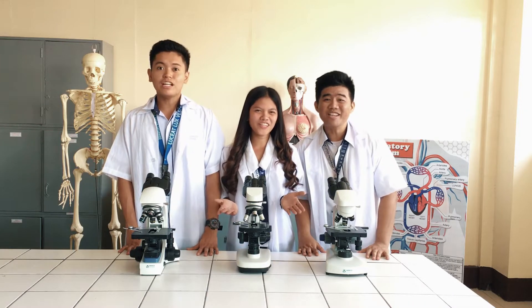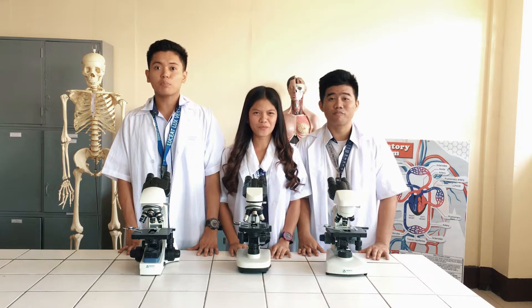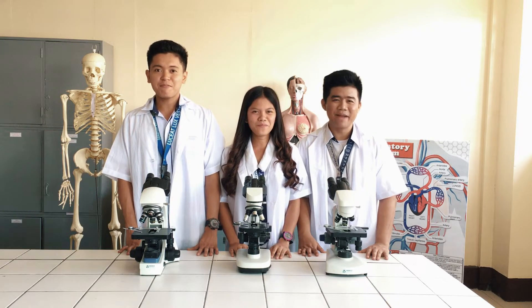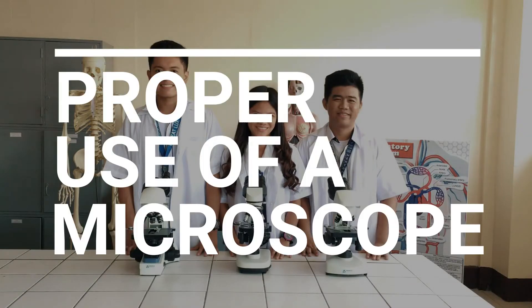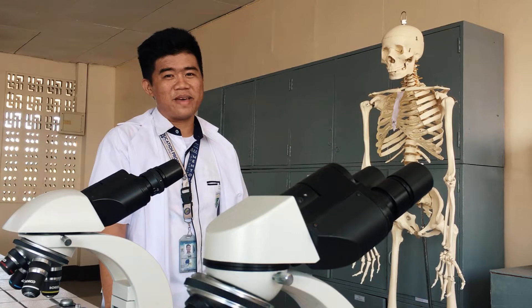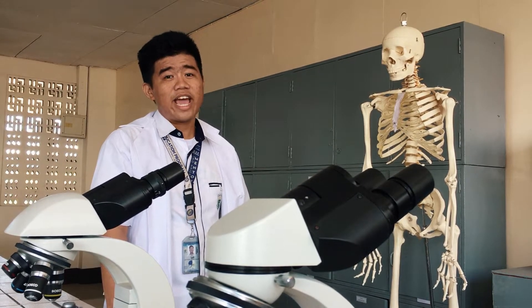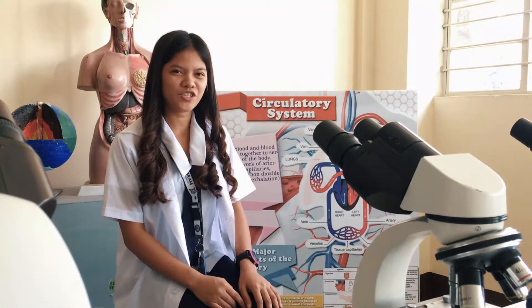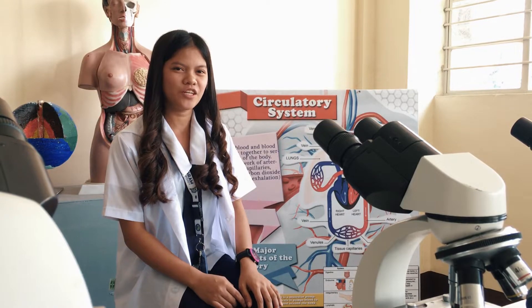Hey! We are General Science Majors and today we're going to teach you how to properly use a microscope and prepare a wet mount. A microscope is a high-quality instrument and should last 25 to 30 years if treated properly and with care. Following these simple instructions will not only help you care for your microscope and keep it in good condition, but it will also help you get the most out of your microscope.